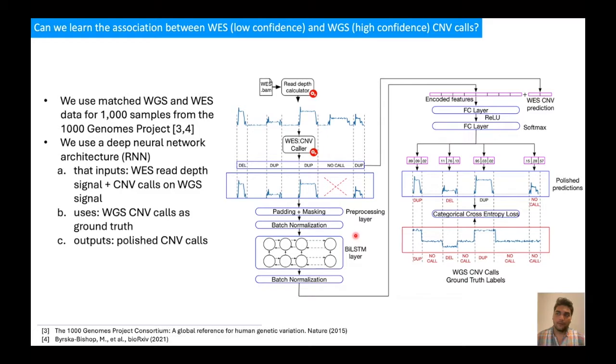As we see, it is a multi-input neural network designed for polishing and improving the performance of exome-based germline CNV calling. The pipeline for the categorical CNV prediction case can be divided into 3 main building blocks, and it can easily be modified for the integer CNV prediction case just by changing the softmax activation with a linear activation along with a suitable loss function.